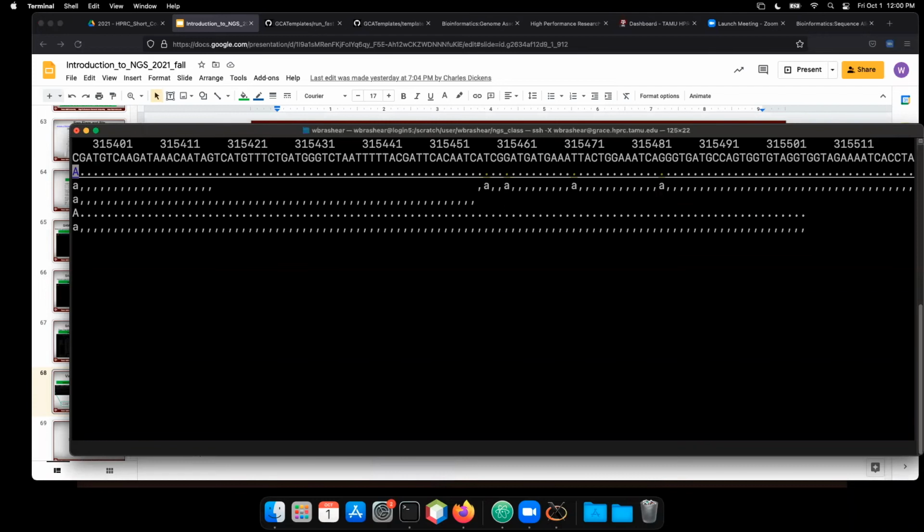All right. And so now this looks like a homozygous mutation. So right, if we're working with a diploid organism, that means it's homozygous in that position for both. And what this means is that C is the reference sequence, but our sample contains only A's. The dots here mean that it matches the forward strand. The commas match the reverse strand. Capital A, it doesn't match the forward strand, and lowercase, it doesn't match the reverse strand.